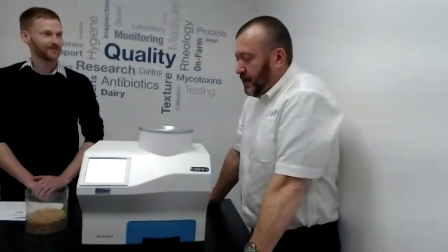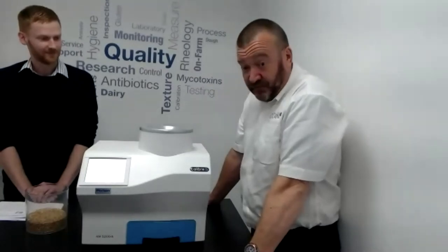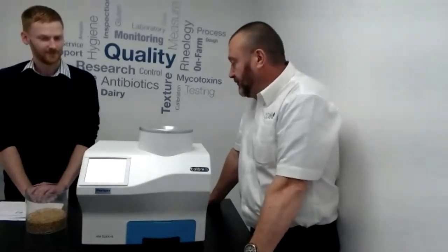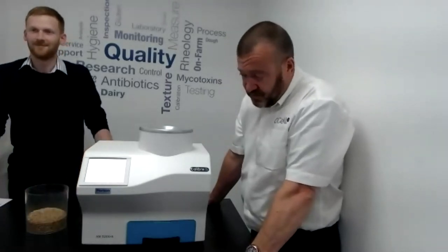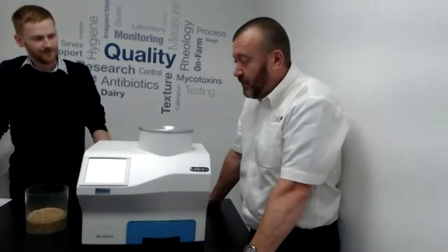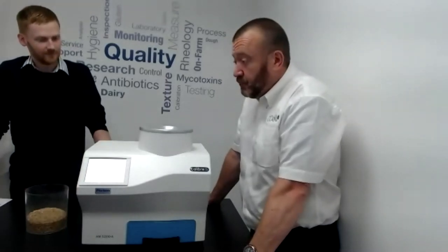Thank you. Hi, good morning everybody. When we get these instruments in, we check them with the UK Grain Network samples. We have the moisture content and specific weight for barley, wheat, rapeseed, and oats, and we set them up so that they are accurate to those standards.